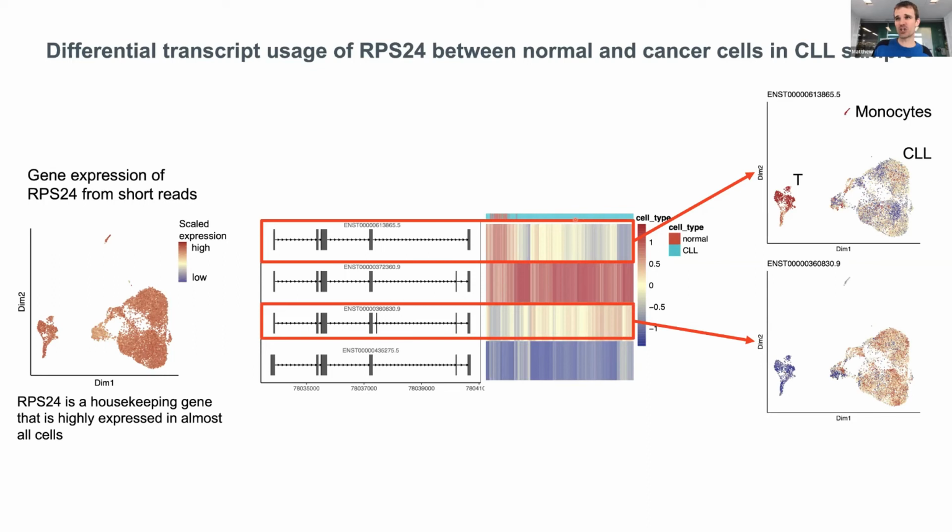It's got higher expression in the B cells and lower expression in the normal cells. And so I could bore you with these plots all day. There's hundreds of them. I think they're really beautiful. And I guess they just show the extra level of detail that you're getting from this protocol, which might be really interesting if you want to study splicing in greater detail in your samples of interest.